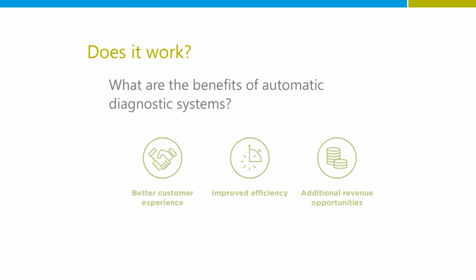And then being able to do this in a cheaper fashion, so less manual involvement with moving data around or staring at data points to come up with a classification. If you're able to automate that, you can do it cheaper and run much more results through to get that in the hands of your customer faster. You really just want to touch the data less and make sure the data keeps moving through the system as fast as possible, and get the personnel you have on staff doing more value-added tasks instead of the menial ones that could potentially be automated. And what this will do is give you more scalability opportunities to potentially pivot into other industries, as I mentioned with the last seminar topic, and be able to provide more lab results than you might be doing right now. And let's face it, efficiency can make or break a company.